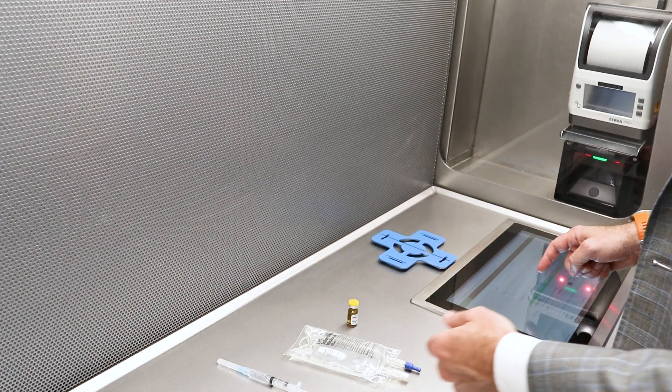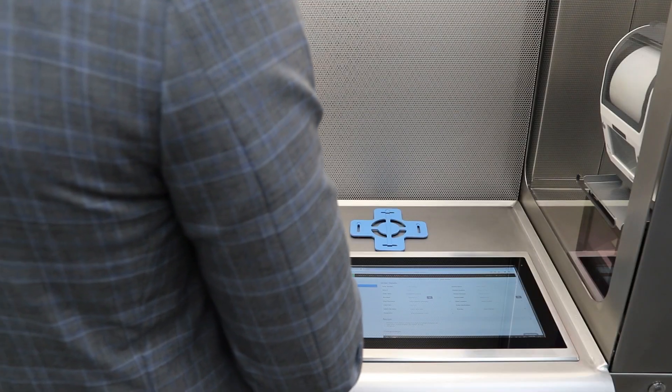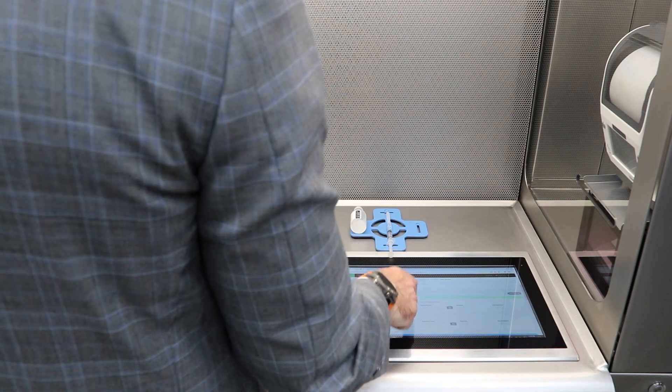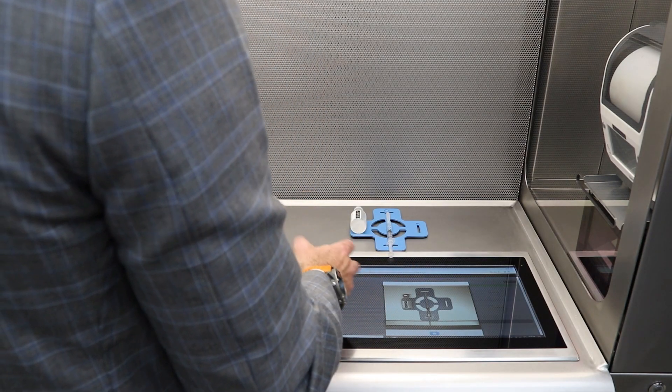Once I've validated my components, I'm going to actually withdraw my syringe here. Now I can actually launch my camera to take a picture of that syringe, and I can actually document any photos that I want to.